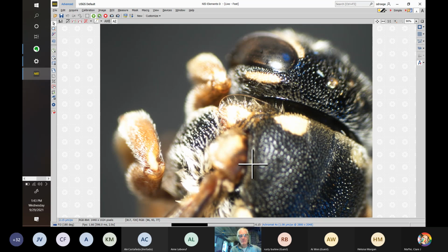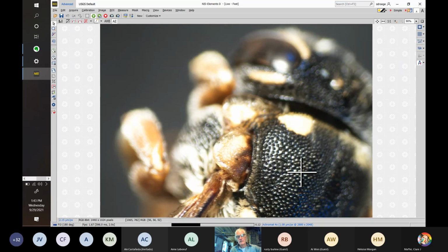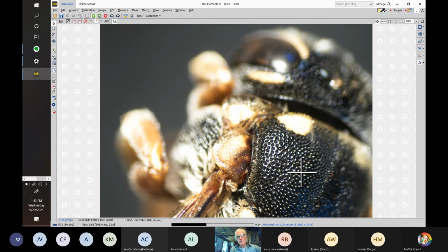Before you move it, will you resharpen that to the tegula? Yeah, the tegular was better because you can still see the transparent collar that way. All right, let's go there. How about that? And I believe the tegula often has, maybe always has, a transparent edge too. I'm not sure about that. Again, I don't see this species very often unless I'm collecting out west or looking at a Western collection. Who has time for that anymore?